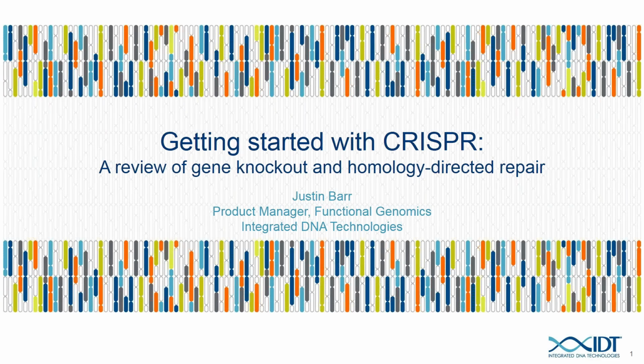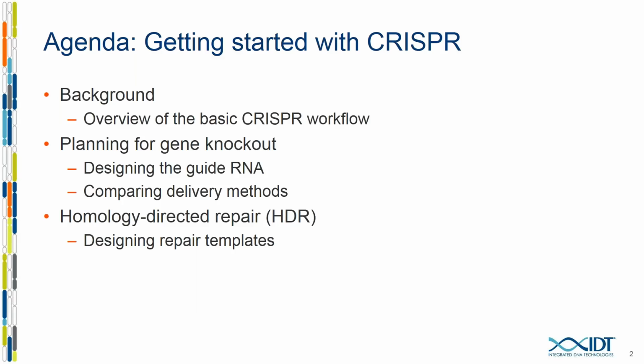So if you don't have a CRISPR background already, that's okay. We'll touch on the basics as I go through, and then as Hans mentioned, I'm happy to answer questions at the end. So to get started, here is a quick overview of what I'd like to cover. First, a basic CRISPR workflow to give us some background to consider as we move through the rest of the steps. And then I'll jump straight into planning for a knockout experiment.